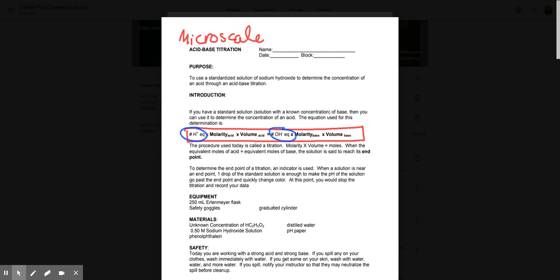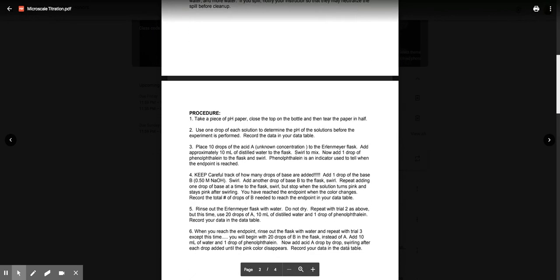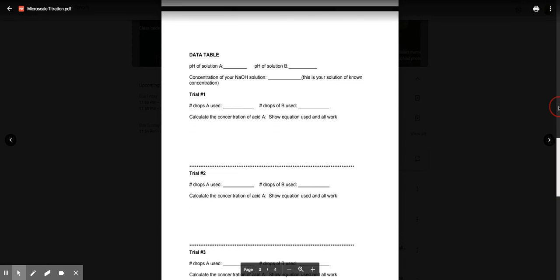Going back here, you should have seen that we had the flask, goggles, graduated cylinder, all this stuff here. We did not use distilled water because I was recording at home, but really you should just because it eliminates some of those extra ions in solution.